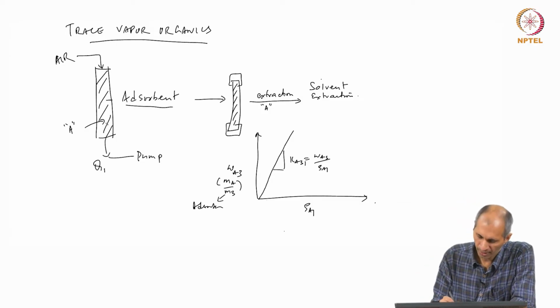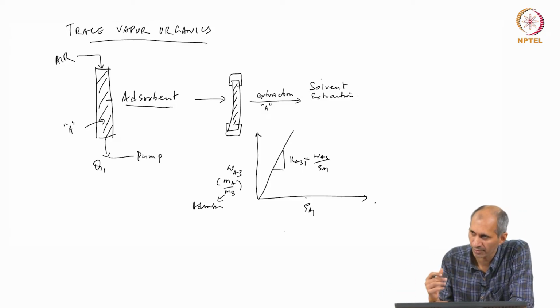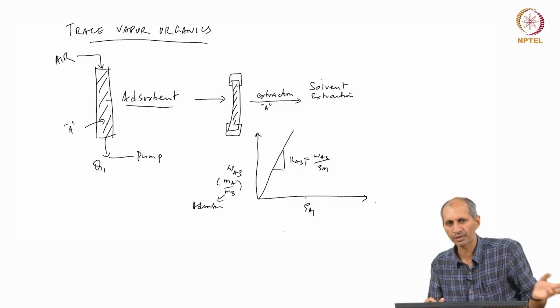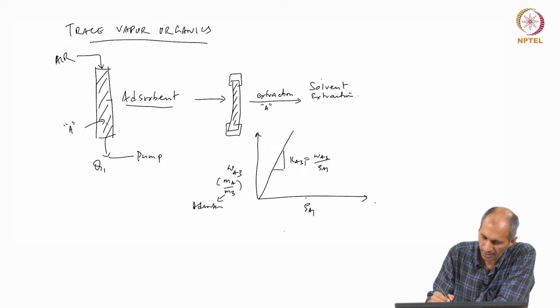So, when you have a concentration in air and bring it in contact with the adsorbent, the mass transfer is favorable towards the solid, and therefore you will end up transferring most of the material from the gas phase into the solid phase. But that is in the sampling.